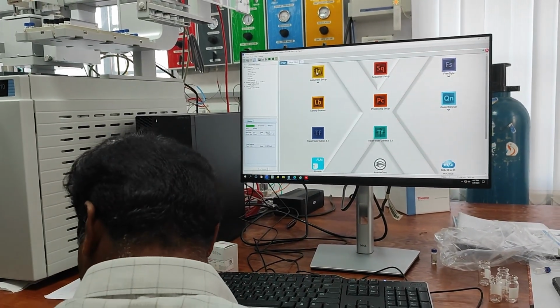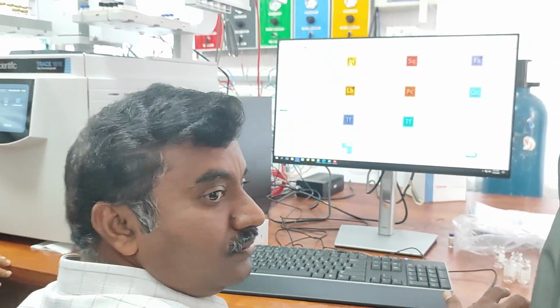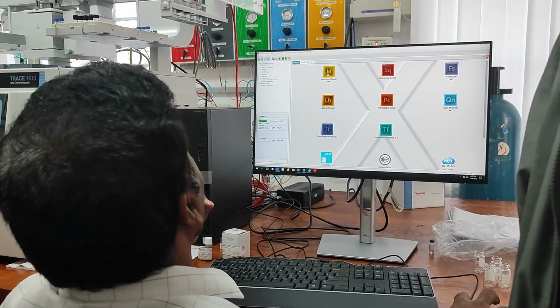हाँ. आपको दिख रहा है सर? ठीक है, तुम पीछे आ जाओ. See here. मैं पीछे आ जाऊँ.